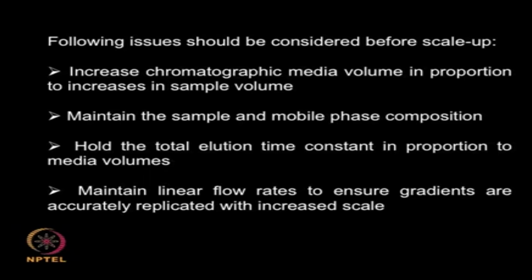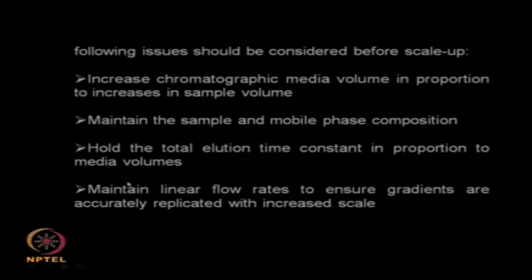Then I would like to maintain the same elution time. If I am doing a protein purification in the lab and my elution time is 35 minutes, I do not want to be running for hours. If I am going to scale up, I want to see whether I can achieve the same elution time, that means the same 35 minutes. So if I am going to increase the media volume, how much is the elution time going to change? So I need to consider that aspect also.